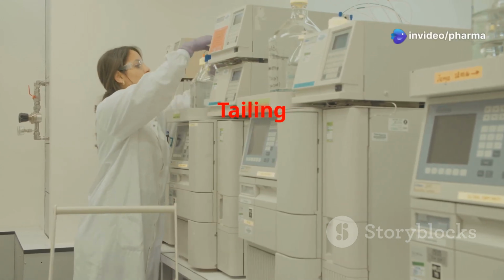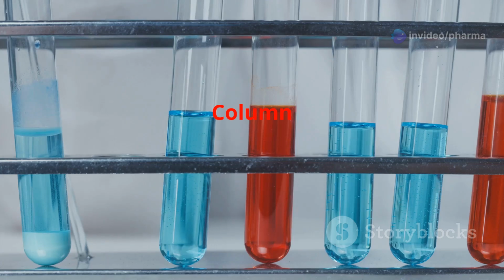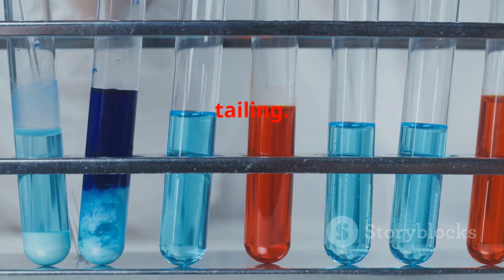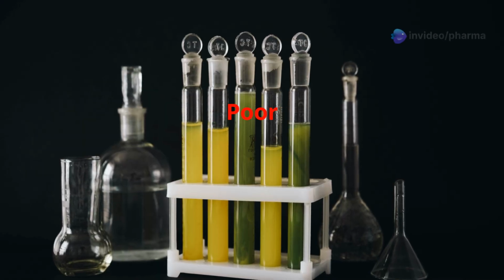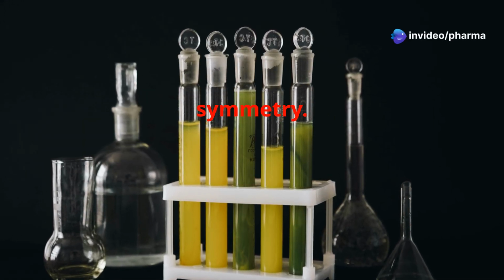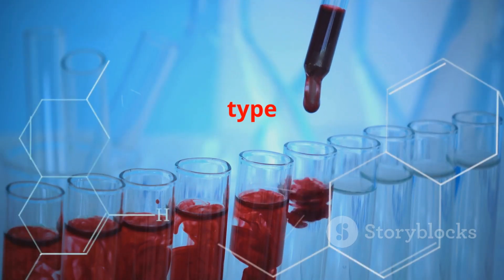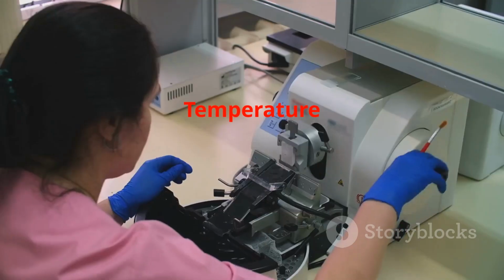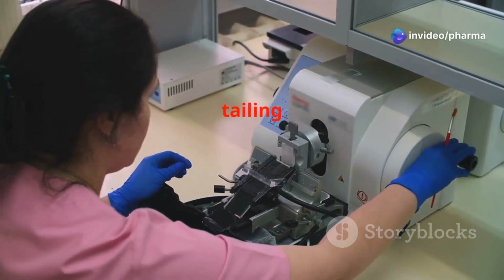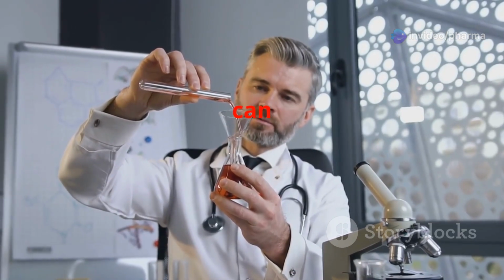Factors affecting tailing. Several factors can lead to peak tailing in an HPLC column. Overloading: too much sample injected can cause peak broadening and tailing. Column issues: poor column packing, contamination, or degradation can affect peak symmetry. Mobile phase composition: the pH, ionic strength, and solvent type may influence peak shape. Temperature and flow rate: suboptimal conditions for the column and mobile phase may result in tailing peaks. Sample matrix: contaminants or impurities in the sample can cause peak tailing.